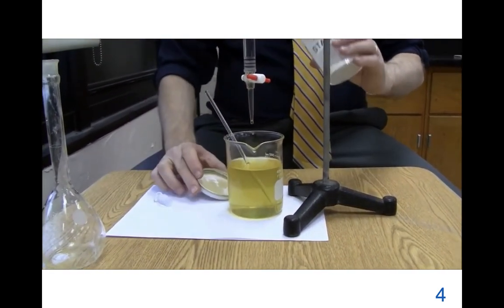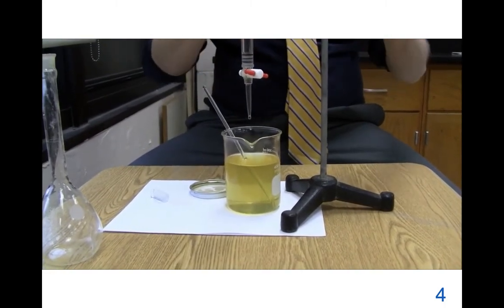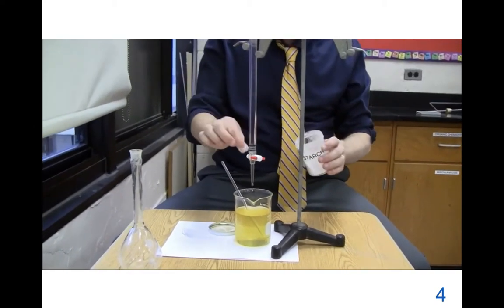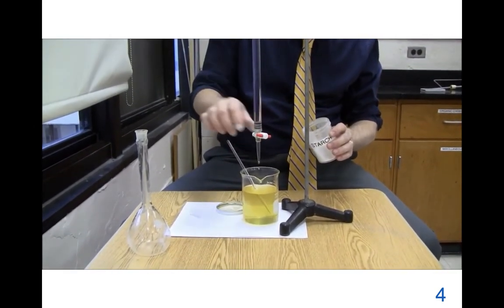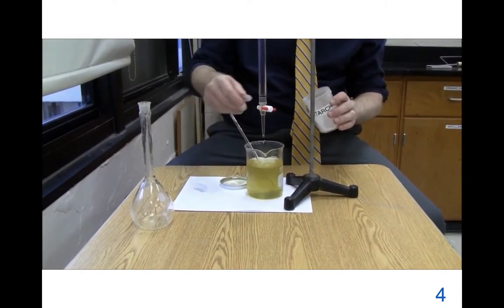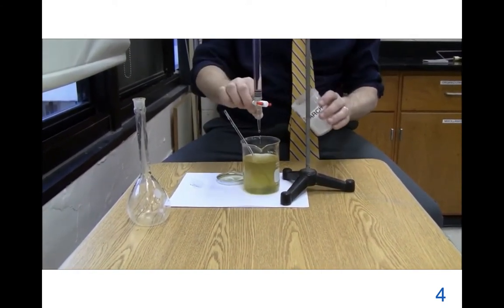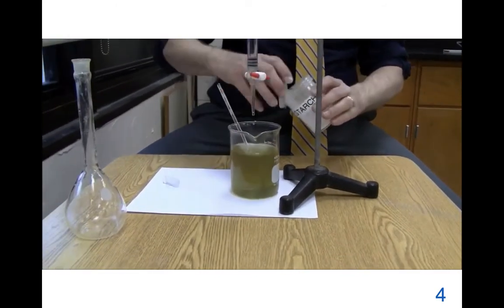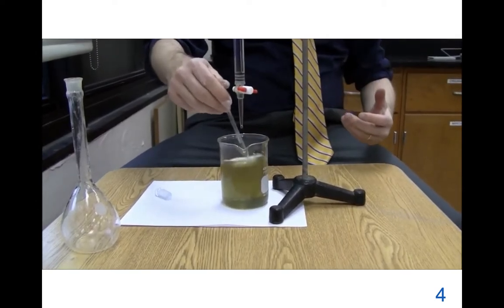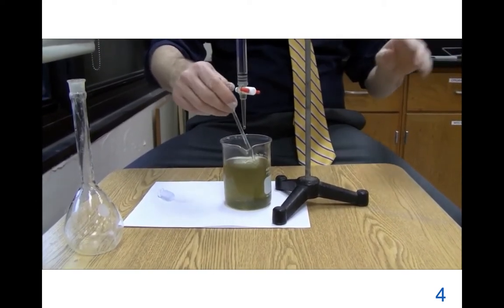Add a little starch, non-toxic, literally a pinch. Literally 2 pinches. Okay, so the end point is now sharpened. It's hopefully going to be 1 drop, changes everything.